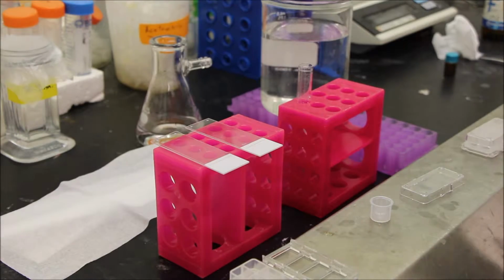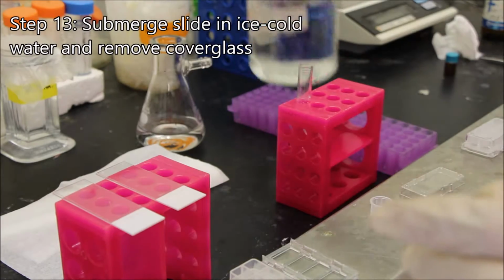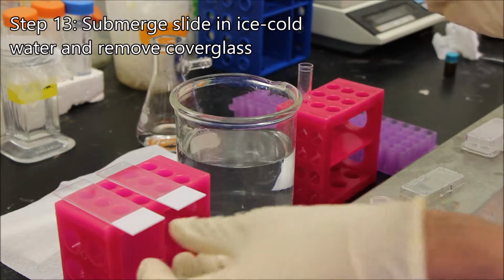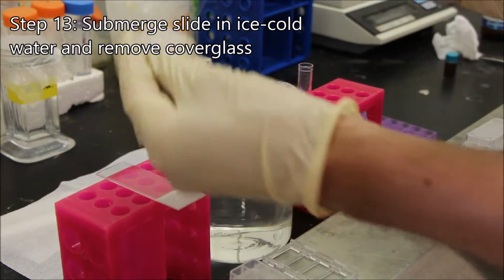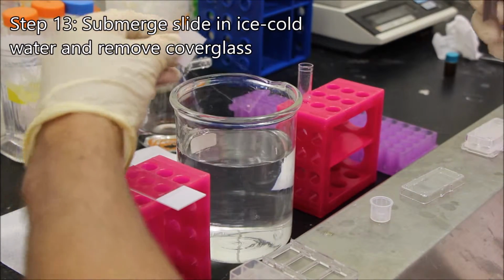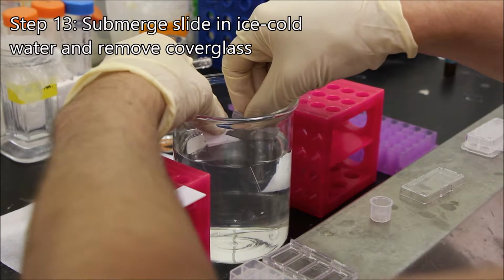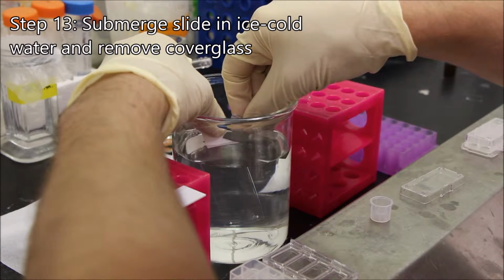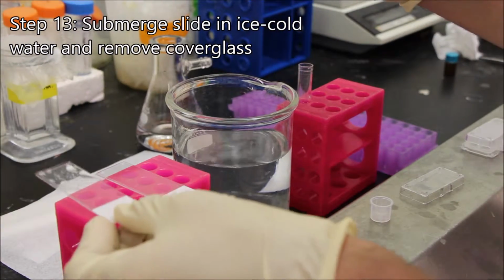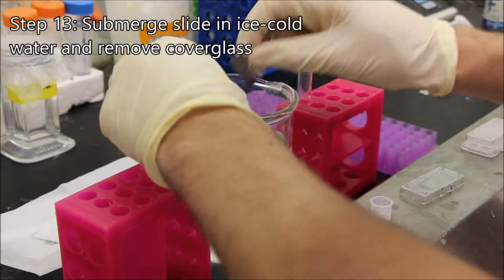Alright, so now the 15 minutes is up, and I've got some ice cold water here and a razor blade. What we're going to do is take the gel, if I don't block your view here, submerge it, and use the razor blade to carefully remove the top glass. And I'm going to place this on a Kim wipe to dry off any excess water, just from the bottom of the glass.